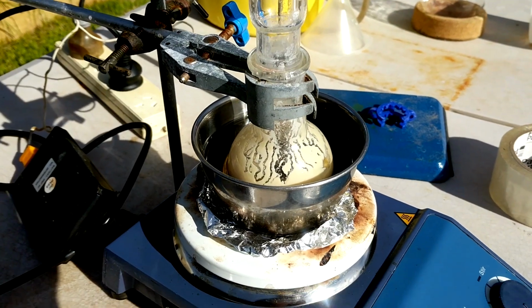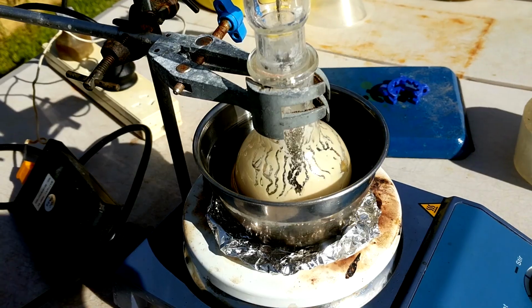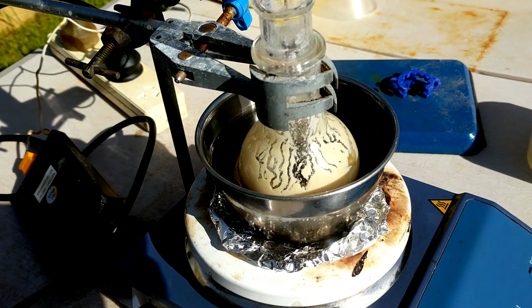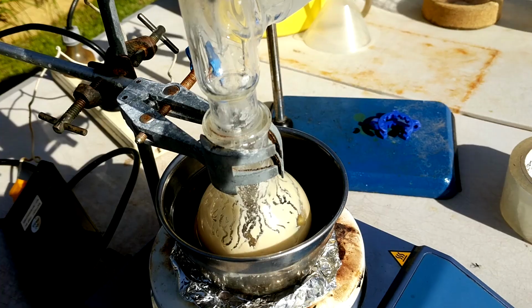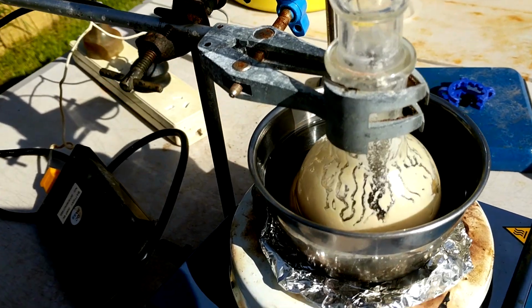Alright, the distillation is complete and we have quite a bit of solid left in the flask. It's obviously just losses to our yield. It's obviously just niacin that's come over in the first distillation of the pyridine. It looks like it's been splashed around, but it hasn't really looked like it's been sublimed up in the flask. The re-distilled batch of pyridine should really be free of any niacin, which is good.